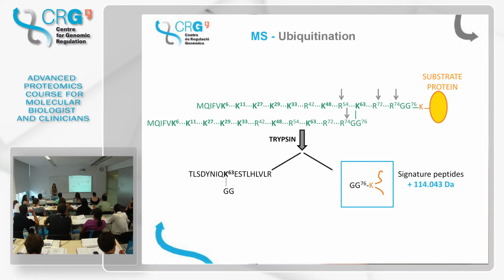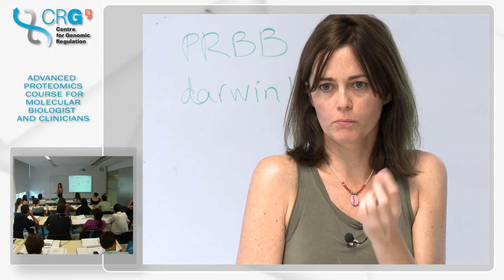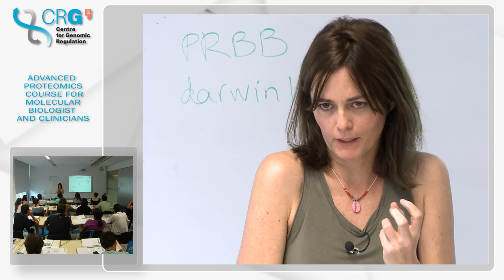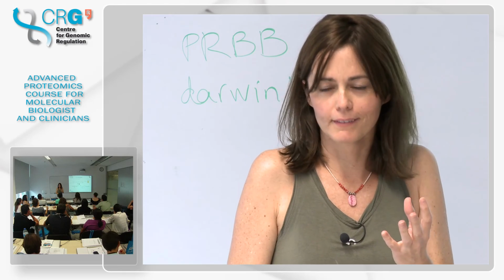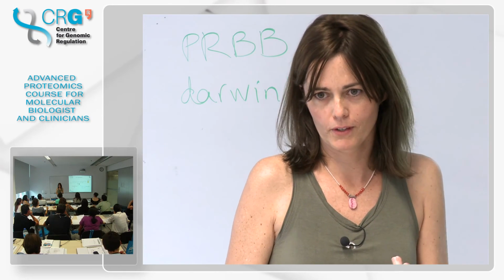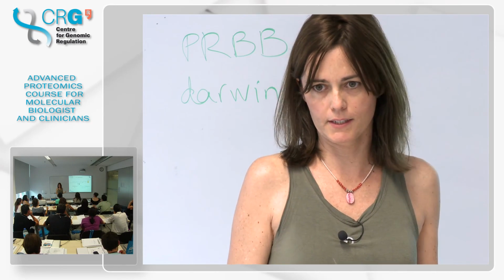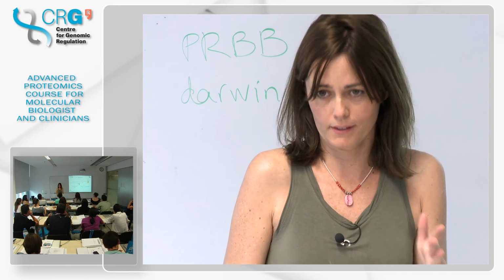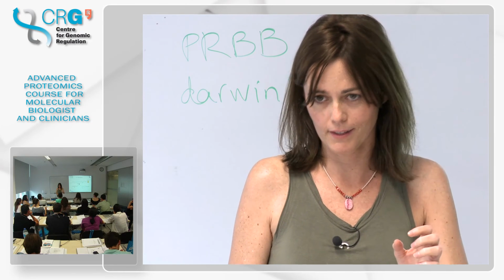It is possible to determine the ubiquitination when you have several lysines, one next to the other, so very close lysines in your protein? For example, many lysines together, well, then the problem becomes that the peptide is too short for mass spectrometry. Yeah, this is an added complication, and then one would need to find different strategies. Of course, every protein, every peptide behaves differently, and one needs to study case to case.